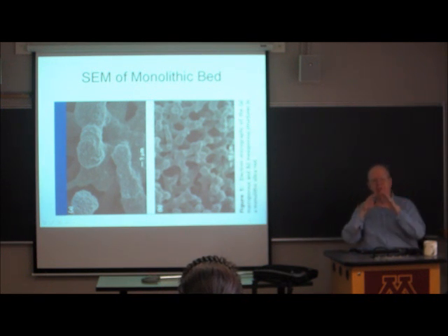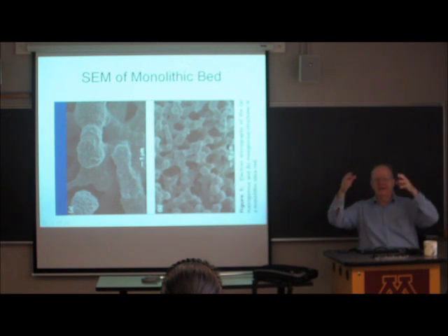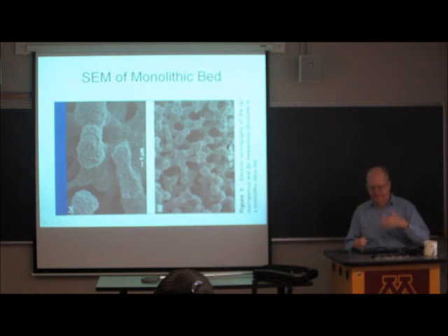A monolith. Mono means one. Lith is Greek for rock. The entire inside of the column is one piece of silica, where all of the chunks of silica are physically unified into a single body. It's really neat stuff. This is a relatively new development in HPLC.